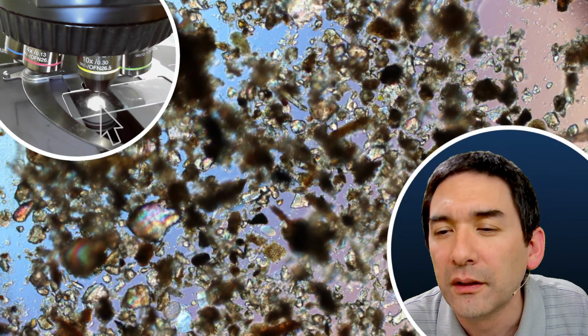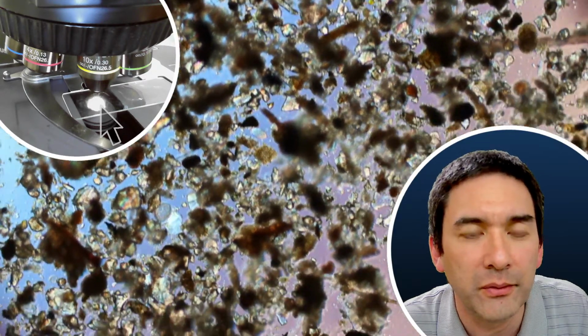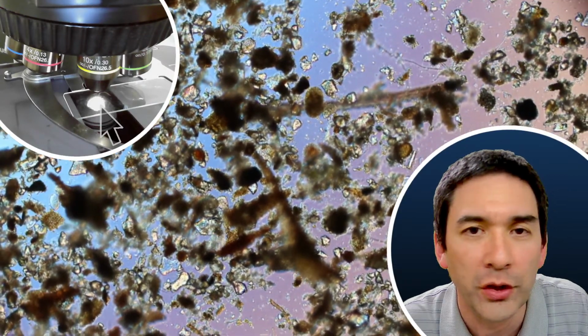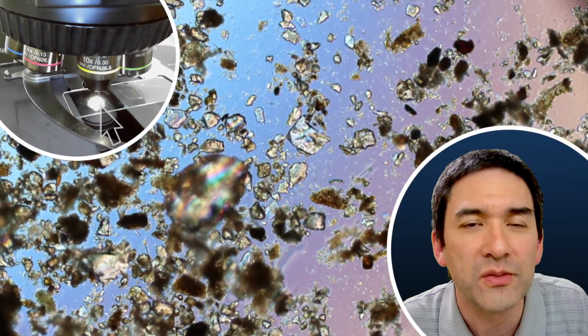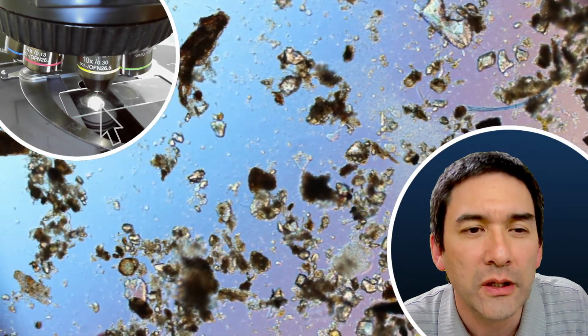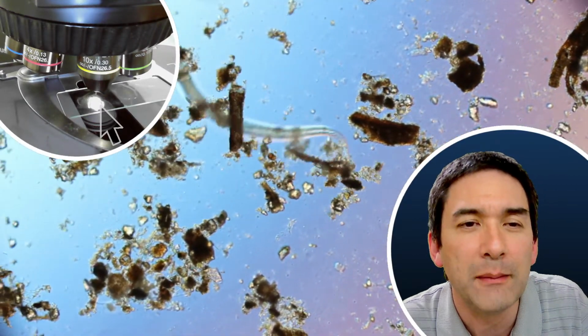Yeah. I just saw a piece of microplastics. Maybe microplastic fibers or so. Unfortunately, I don't know where it is now. You find a lot of them. Even if I collected some water samples from a small stream and from a sediment, you find microplastics. Usually these are fibers. And that's of course a nematode worm here.